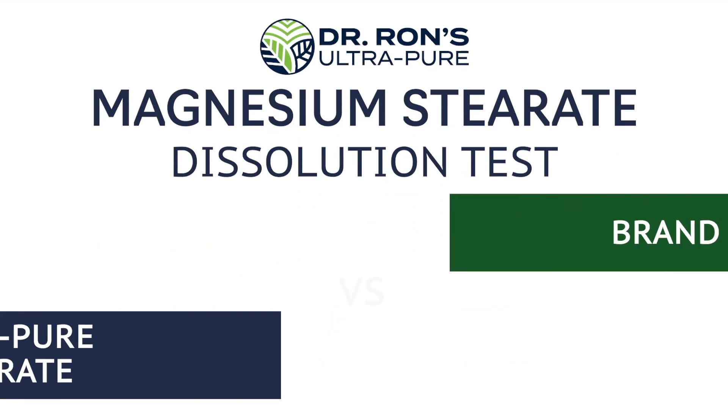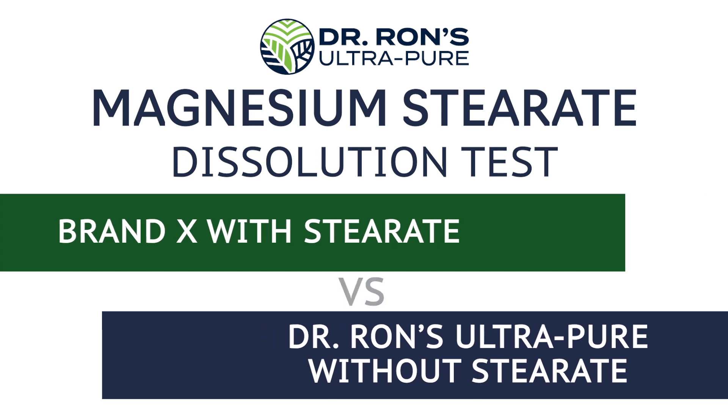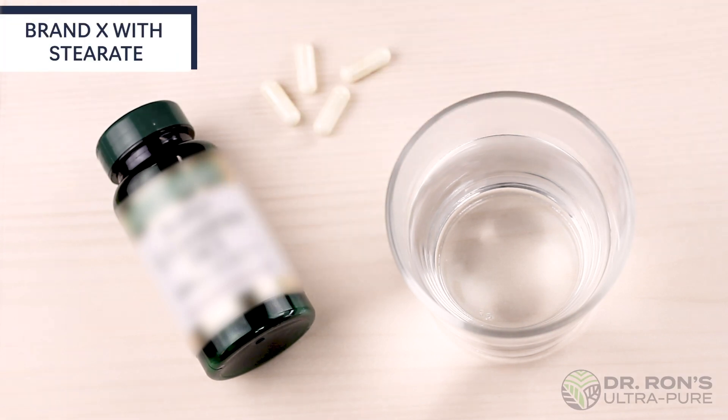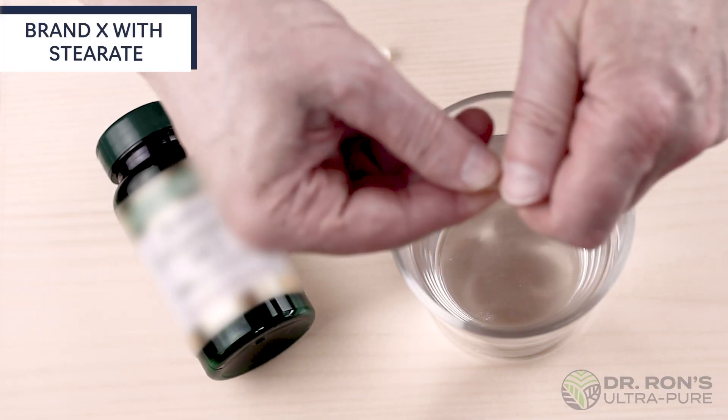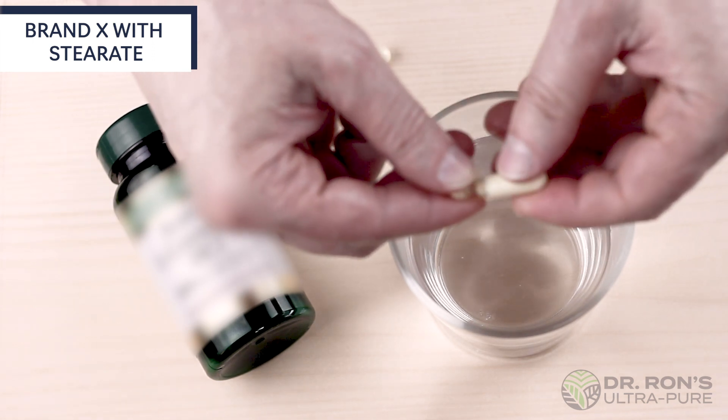We are demonstrating firsthand the difference in dissolution between a product that does and does not contain added stearates. First up, we attempted to mix an encapsulated freeze-dried powder formula containing the lubricant magnesium stearate.